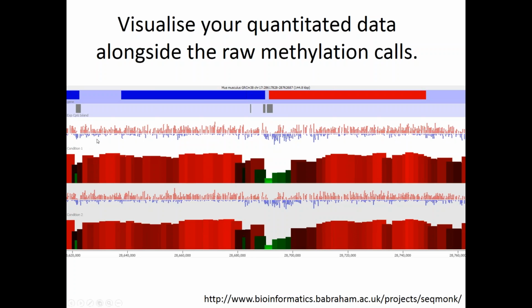So what you can hopefully see is that the two values make sense when looked at against each other. Here the methylation is quite high, and mostly we're getting red dots. But at the point where we get to a CpG island down here, the measured methylation percentage drops and then rises over the CpG island. We can also see the data under here: a big load of unmethylated calls which appear and then drop away.